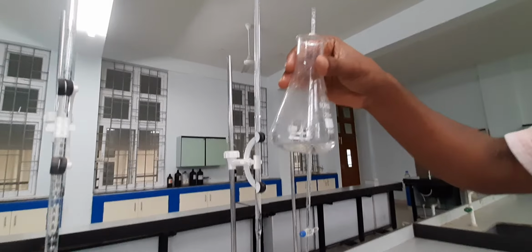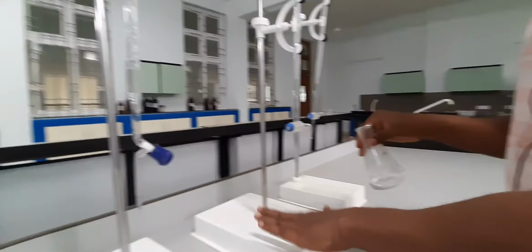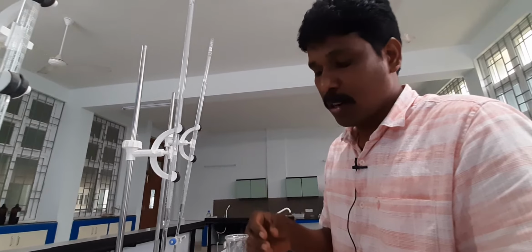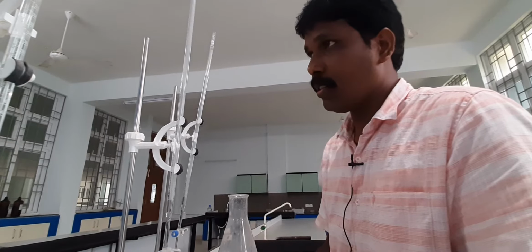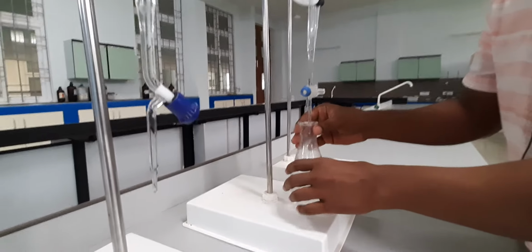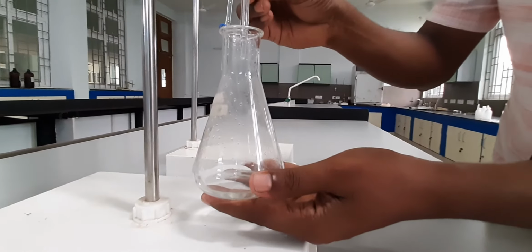However, this is not the case if you start adding the water. When you start adding the water, for a particular concentration of the water, this homogeneous solution becomes turbid. That means a certain amount of water can be accommodated by this composition of chloroform and acetic acid mixture. It can accommodate a certain amount of water, but beyond that point it will show you turbidity. That is the end point that we have to determine by looking at the turbidity.